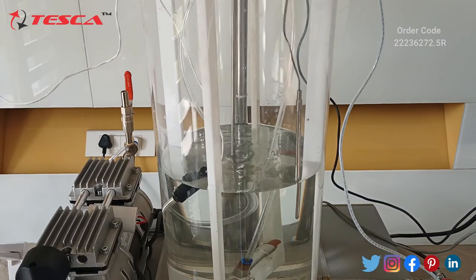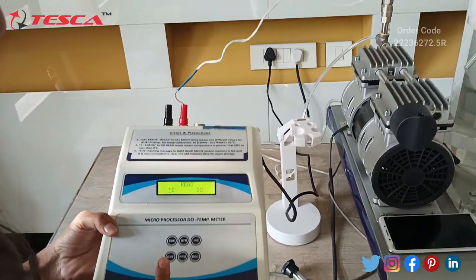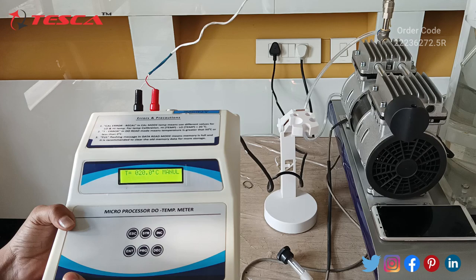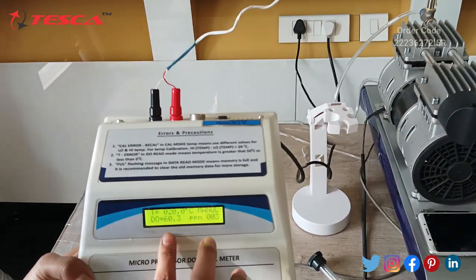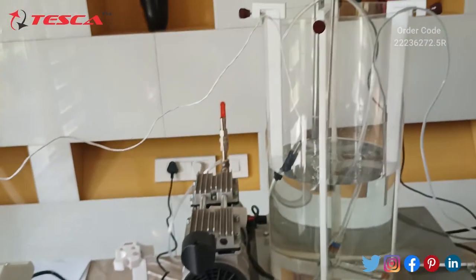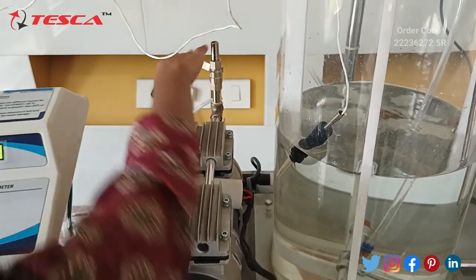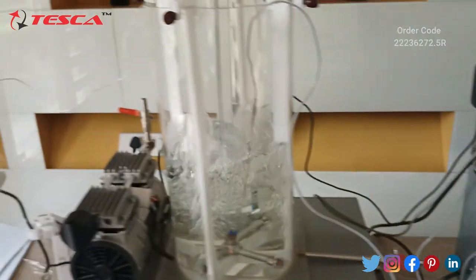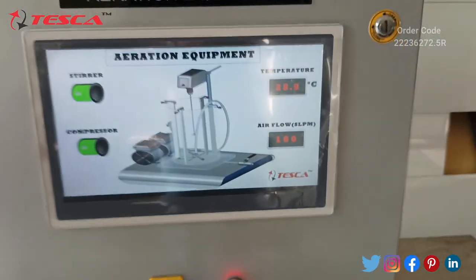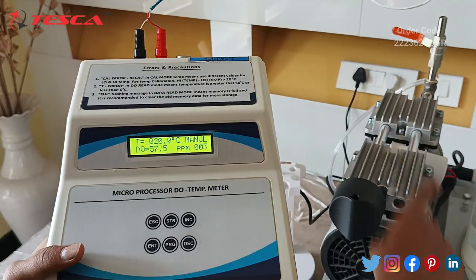You can see the stirrer is rotating. Now we have to control this DO meter — press the enter button, then increment, and again enter, and then you can see the DO level of the water. You can see the DO level is 60.3. Like this we can measure the oxygen level of the water tank. If we turn on the air compressor, you can see the change in oxygen level of the water.